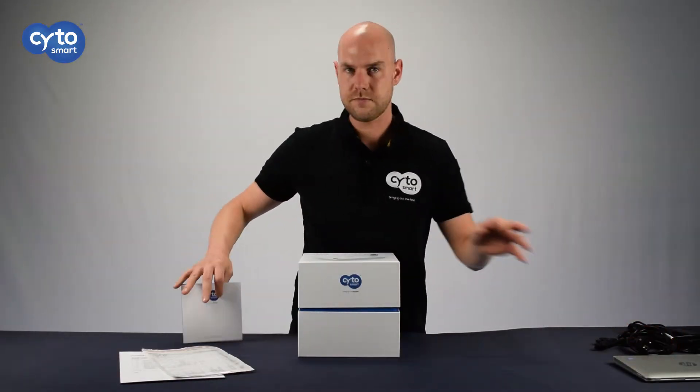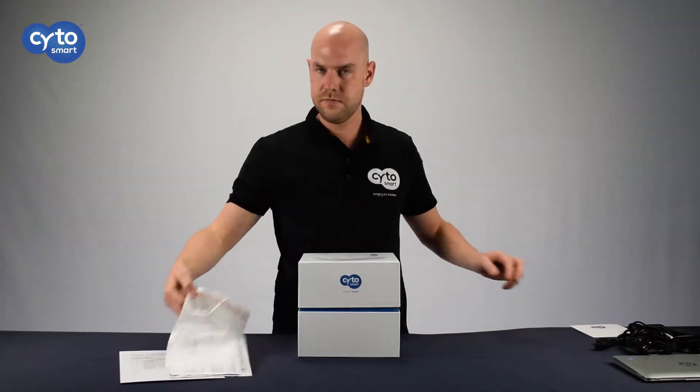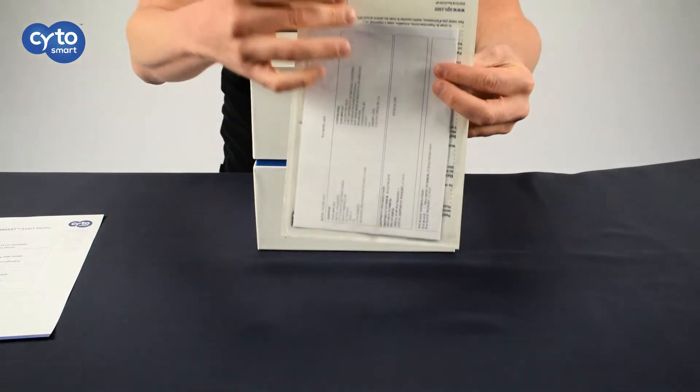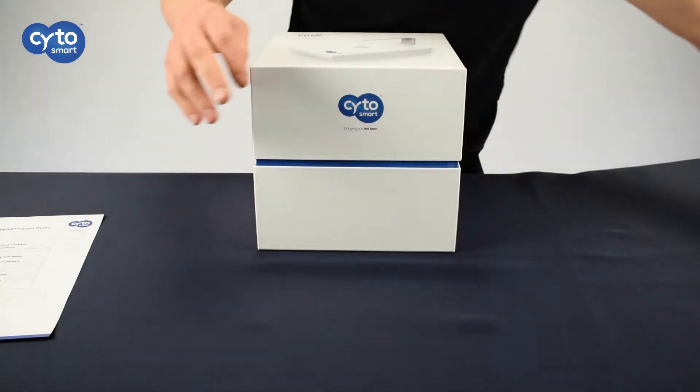We will also include promotional paperwork to tell you about our other great products. Next to that, we will include the shipping paperwork that is always attached to the shipping box itself. But don't worry, the shipping paperwork is only for the courier's reference.